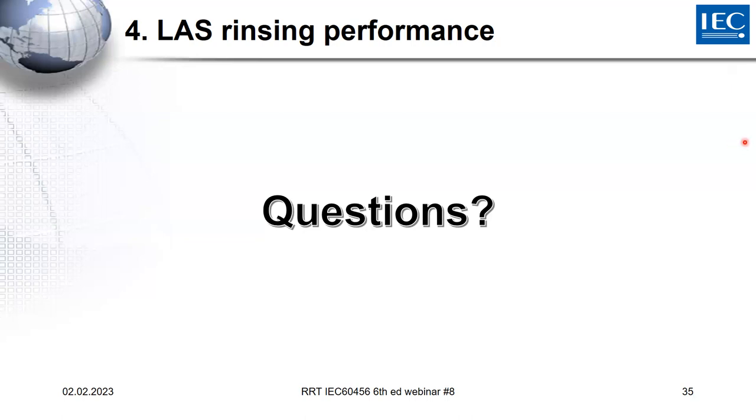So we have two raised hands. All learnings, Markus, we have done in the round robin test in Europe. I think the first one was Lescorp. Hello. I would like to ask you about regular water checks. What does it mean? This is my first question, and the second question is, what checks need to be carried out? Every parameter of the water, or what?